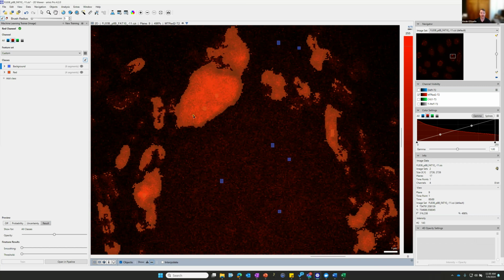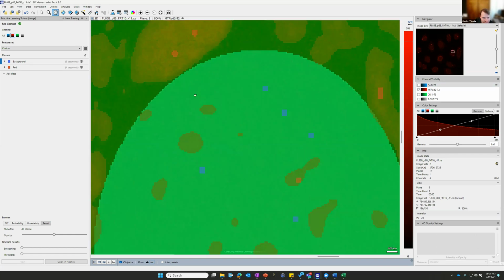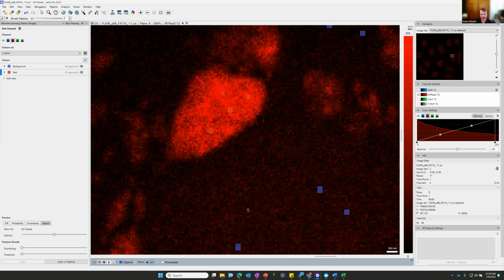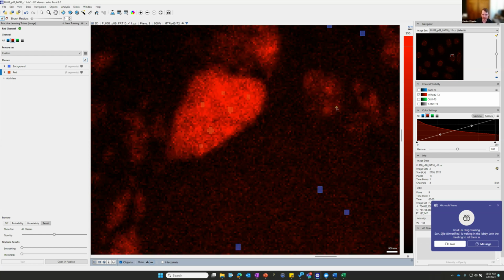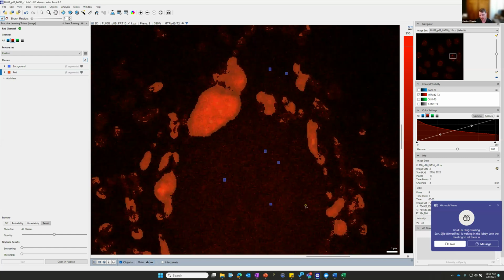it can be frustrating to do a ton of annotations and not have any guidance on where to annotate next, right? So I could go and add a ton more of these red annotations to this spot right here, right? But it's not improving the model at all. It already recognizes this object. So why would I add more annotations to this? Because it already has it right. So having this preview lets you know, okay, you don't have to annotate anymore in this region because it's already got it. But let's see where else it's messing up.